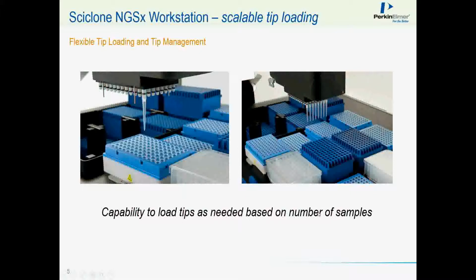Now, one of the features that is very powerful about this particular instrument is you can actually load a variable number of tips. In the previous slides, you saw 96 tips loaded. If you wanted to load all 96, you have that ability and can do full plate transfers. So if you were transferring your samples to Ampure for cleanup, you could pick up all 96 samples at once. However, if you look at this left picture, there's a single tip on the head.